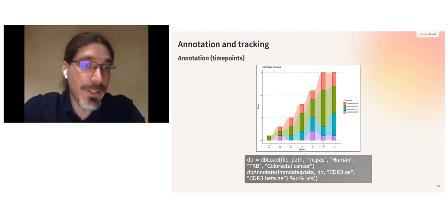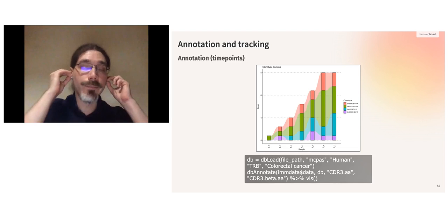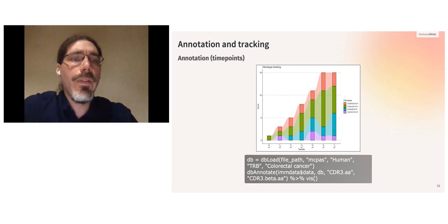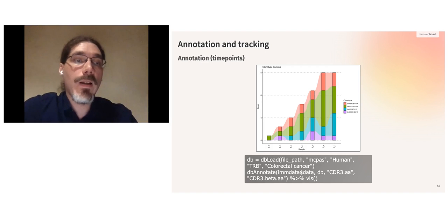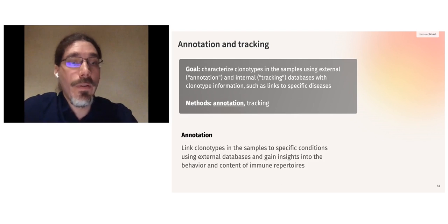So let's consider this example in which we order the samples by their time points. It's a little bit different data. You can see the development of different clonotypes, how they grow from time point to time point.